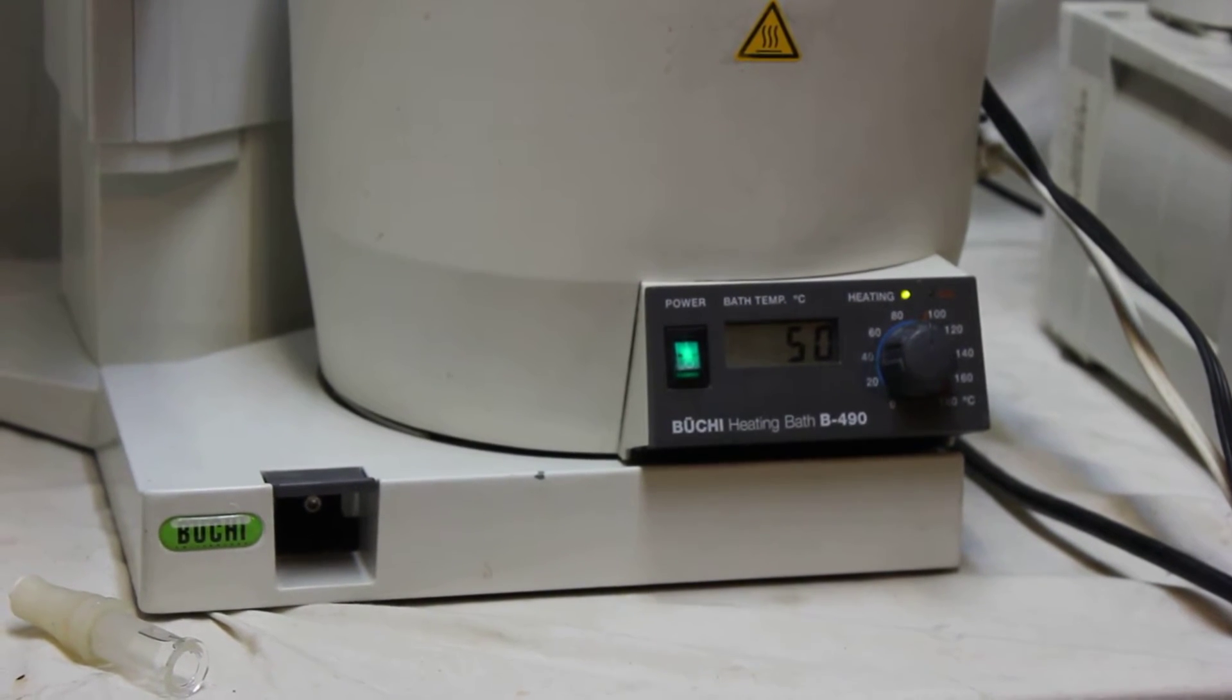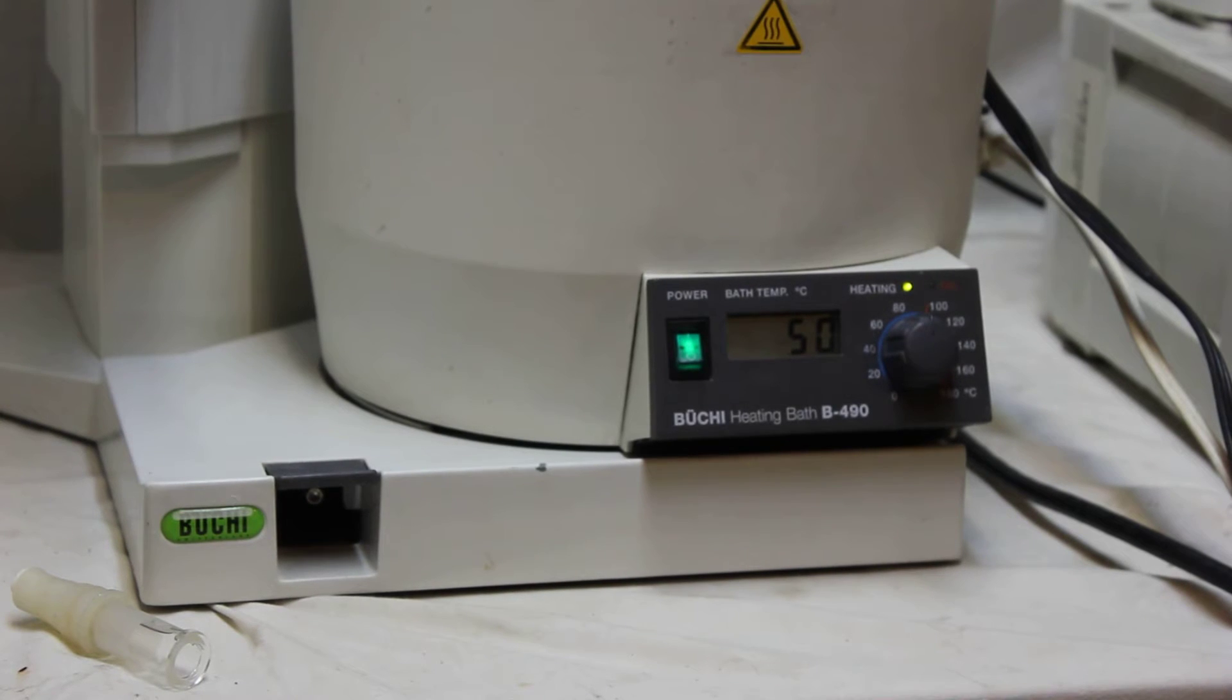B490 is a heating water bath. It can go to 180 degrees centigrade which is for oil, and it does both oil and water.